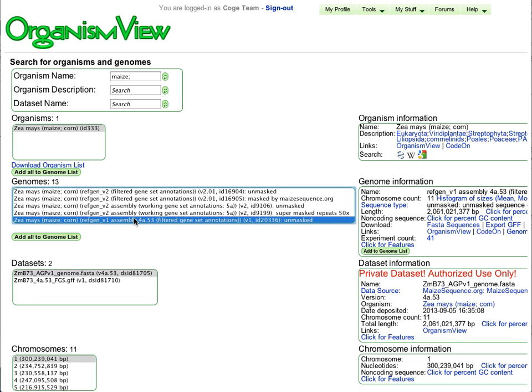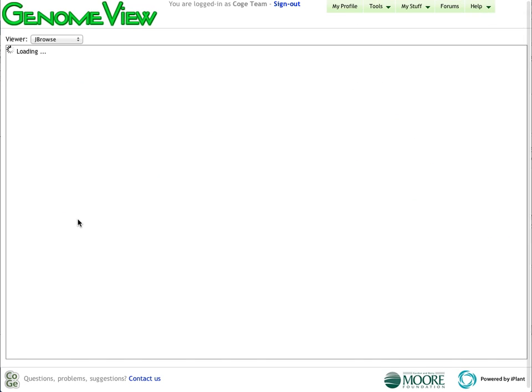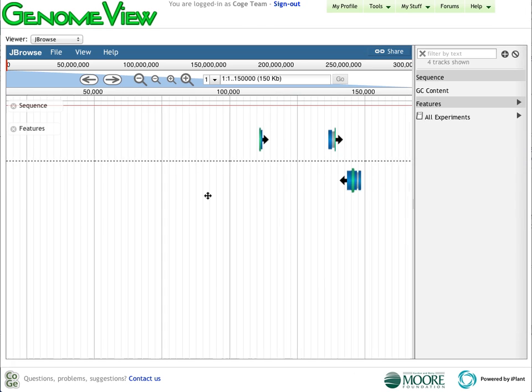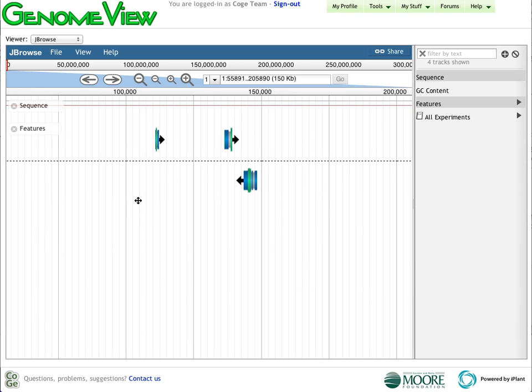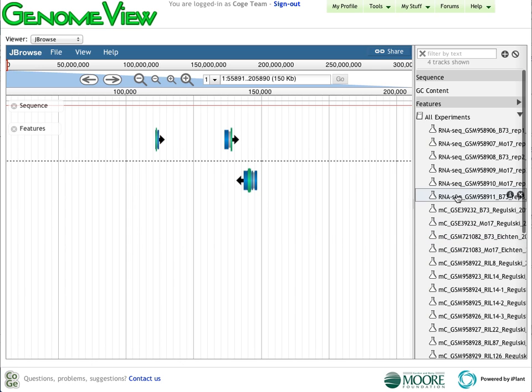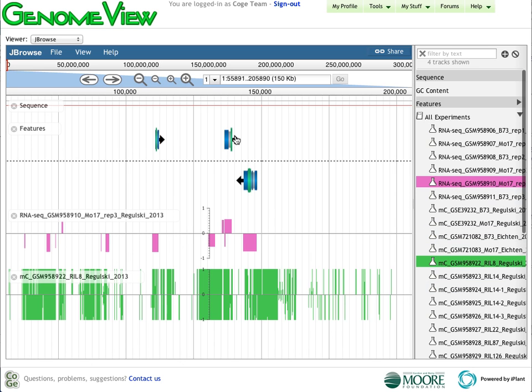I'm going to select RefGen V1, which has associated with it 41 different functional genomic experiments. We can visualize these data with CoGe's genome visualization platform that's based on JBrowse. This middle area here represents gene models. I can take a look at all the experiments associated with this, including some RNA-seq data as well as a variety of epigenetic and functional data.